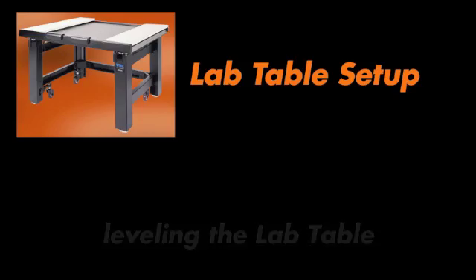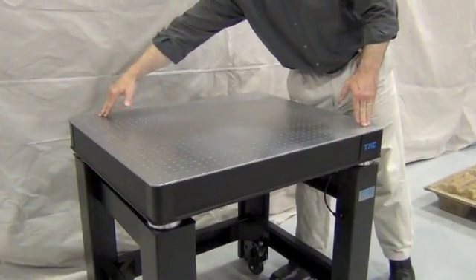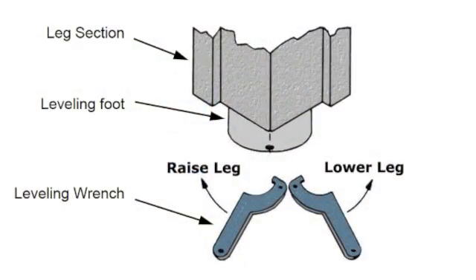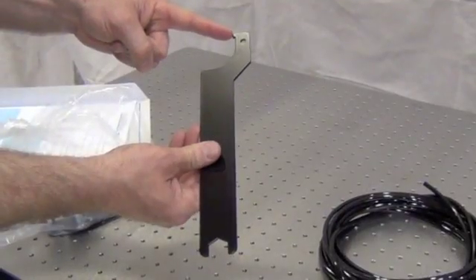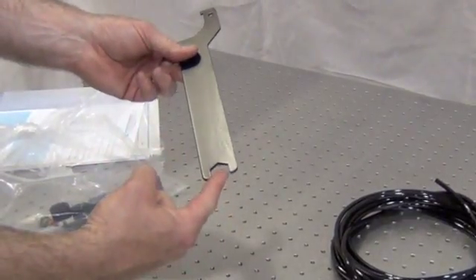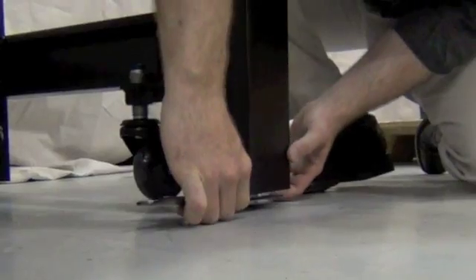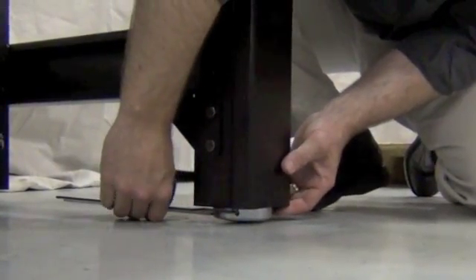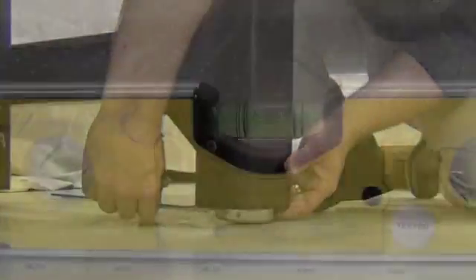Make sure the table is sitting flat on all four legs. If any of the legs are high or low, use the black wrench to raise or lower the leveling feet. Note the point on the large end of the wrench to be used in the dimple on the leveling foot. The other end is equipped for adjusting the casters if that option is included. A carpenter's level can assist with making the top surface level.